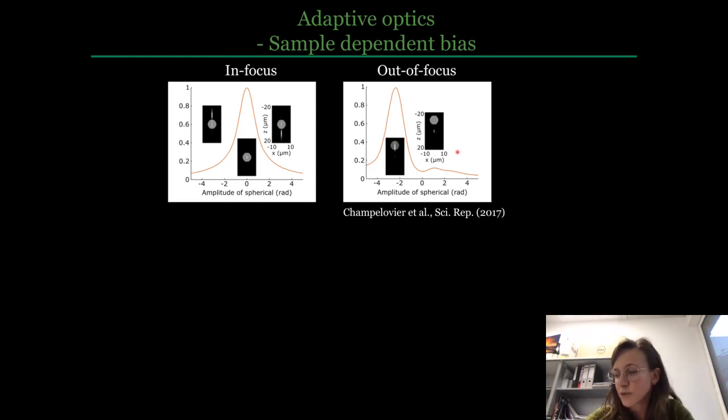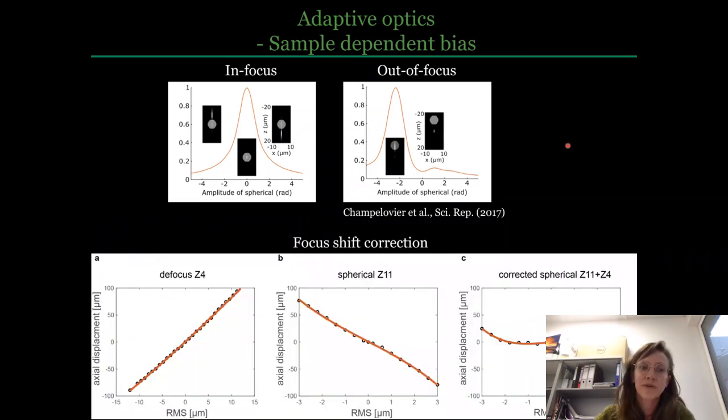So I've worked with 2 different deformable mirrors from Boston and Alpao, and as I previously mentioned, we used an interferometer design for calibration, which was the design and the software provided by the Booth Lab. We calibrated the mirror with our own built Shack-Hartmann wavefront sensor and software, as well as the Alpao mirror was calibrated in-house. And in all cases, we always observed focus shift associated especially to spherical modes. So Z11, Z21, Z36. And you really want to analyze your modes, whether there are axial shifts, to prevent sample-dependent biases, and if there are, correct for this.